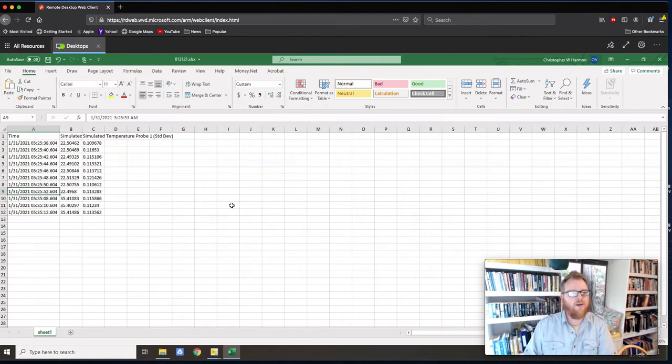So you can see here 5:25:53 a.m. and then 5:35. So that was a long 10 minutes in between those two data points, assuming this clock is accurate. And now you can see, look, it recorded the new temperature value, okay?